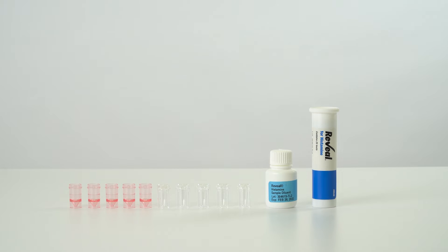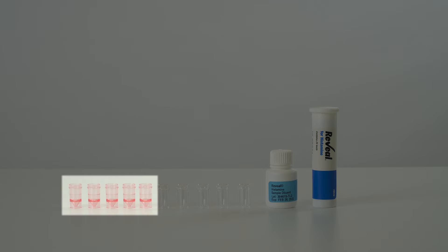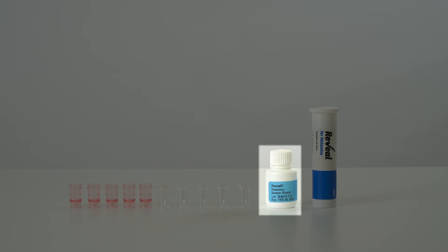Each kit contains supplies to test 25 samples. The kit includes 25 Reveal for Histamine test strips, 25 red sample dilution cups, 25 clear sample cups, and one bottle of sample diluent.